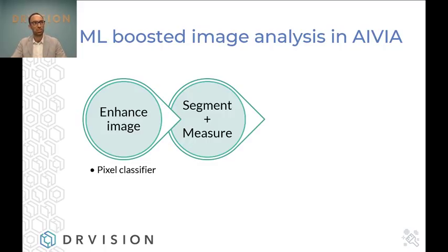I think now there's 15 different recipes for different applications from 2D to 3D plus time. Or you can use the deep learning recipe, which is specific for electron microscopy images, which are very challenging to segment automatically. Most people do it manually by drawing contours in Z, and this is extremely time consuming. So we have an automated way to do this.